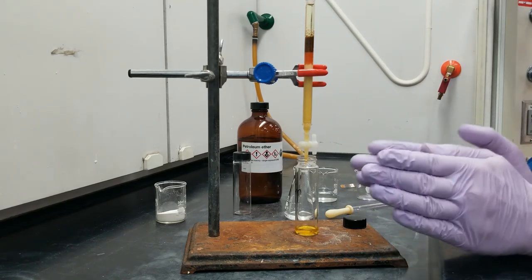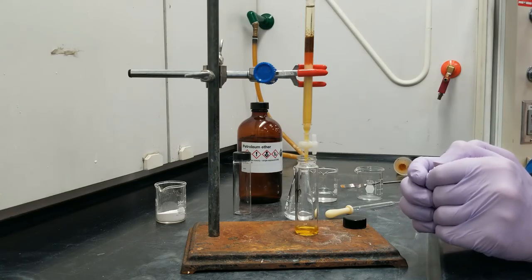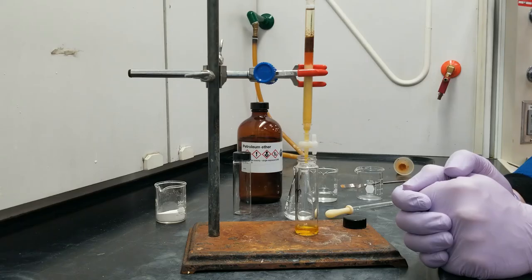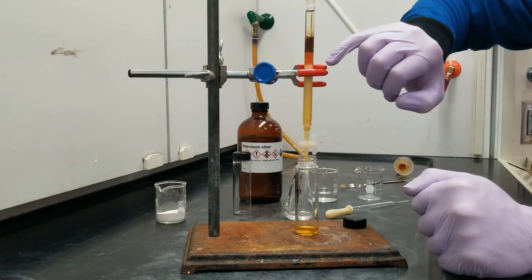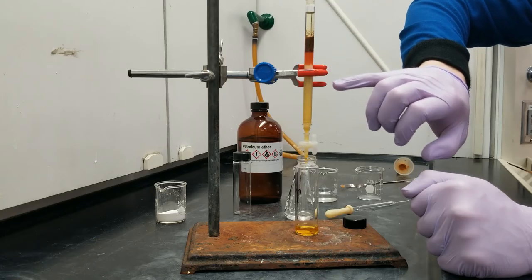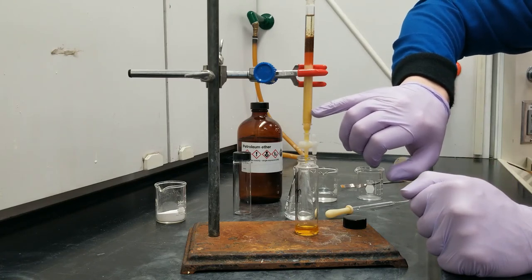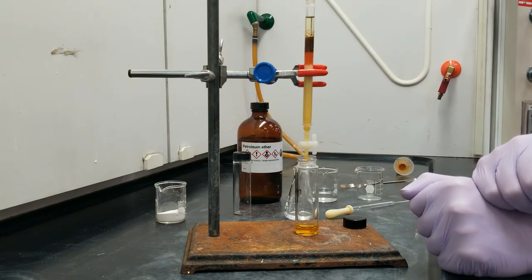So look at this deep yellow color that we're getting here now that all the ferrocene is starting to make its way out. I'm keeping an eye on my solvent level, which is still pretty high, but maybe you can't see it with the clamp, but we should see the color of the alumina return to white as the ferrocene is all removed from the system. And once the alumina down here is starting to look white again and the drips appear clear, that's when I'll know that I've collected all the ferrocene possible.